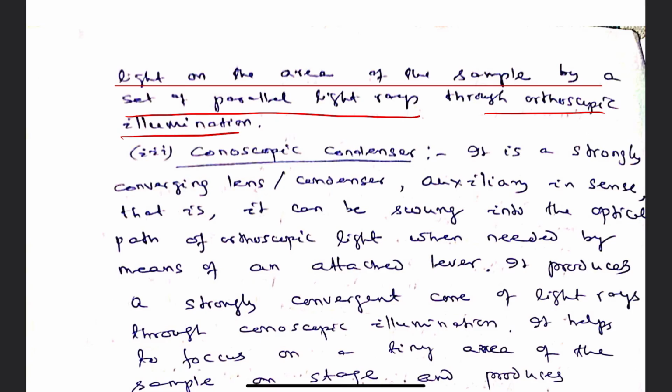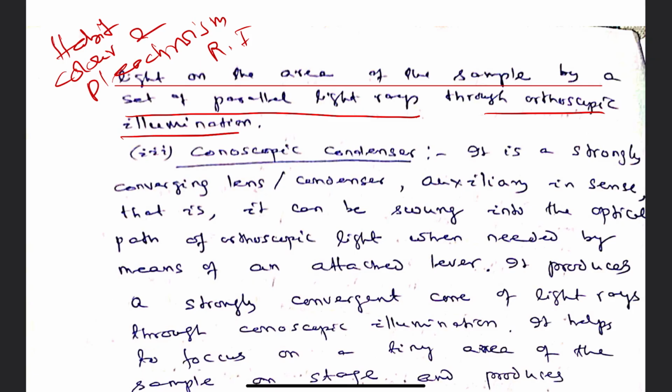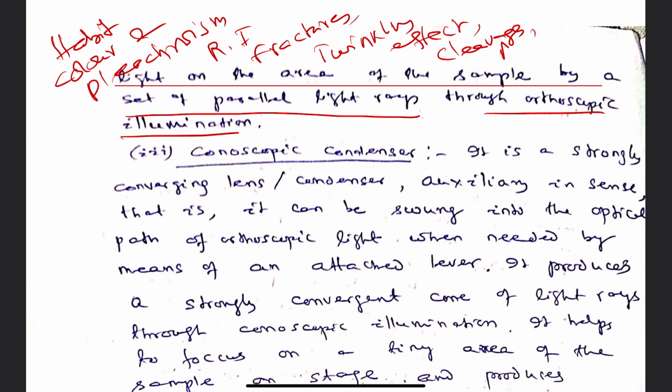So this orthoscopic illumination is being used to study different optical characters of minerals, particularly the habit, color and pleochroism, refractive index, fractures, twinkling effect, cleavage, alteration.